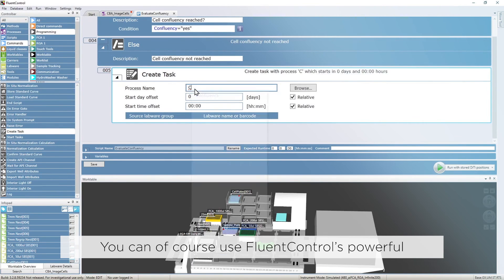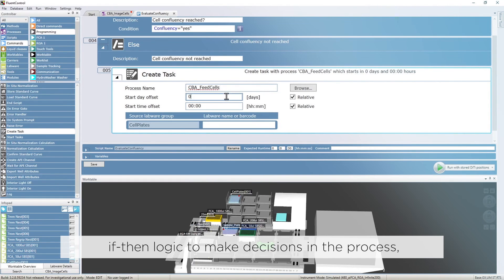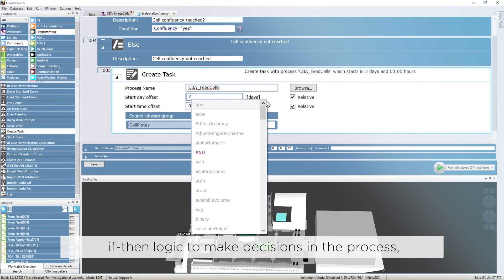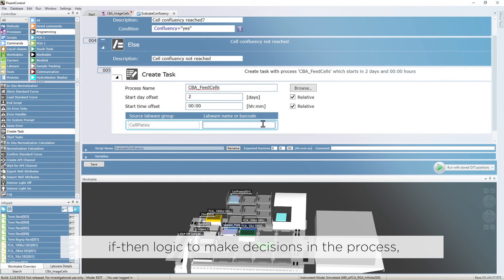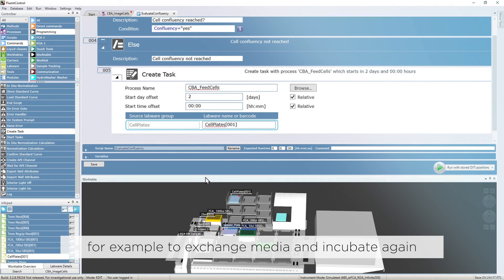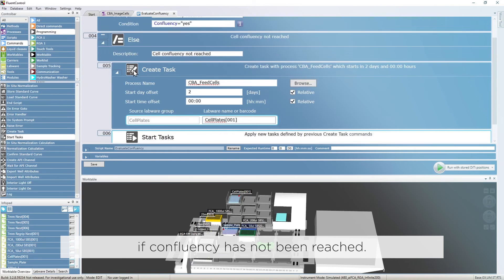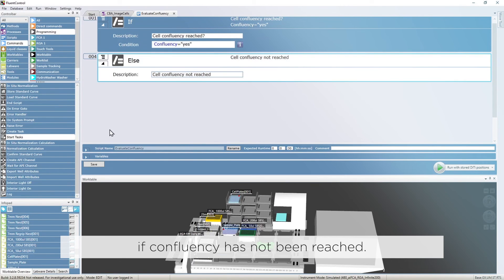You can, of course, use FluentControl's powerful if-then logic to make decisions in the process. For example, to exchange media and incubate again if confluency has not been reached.